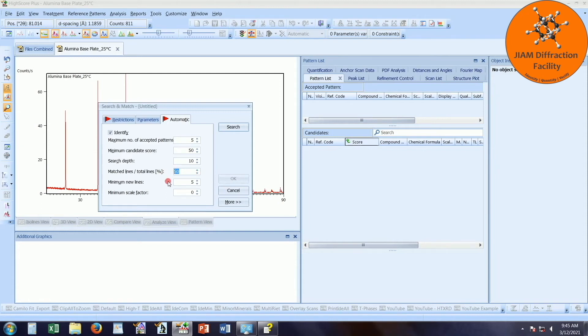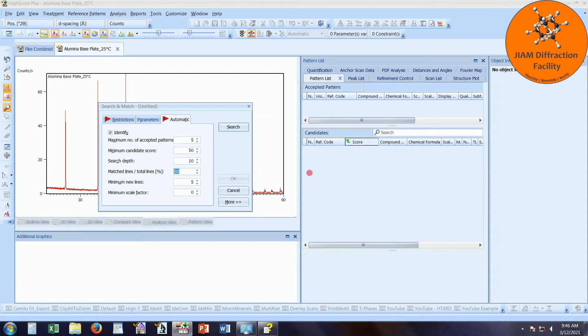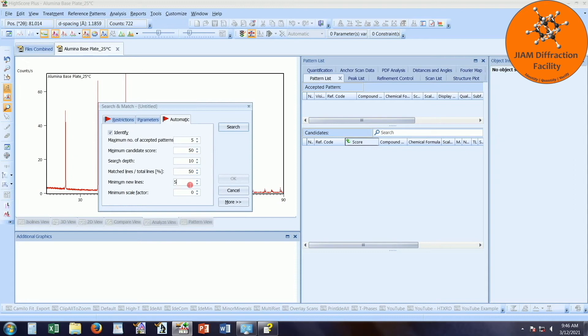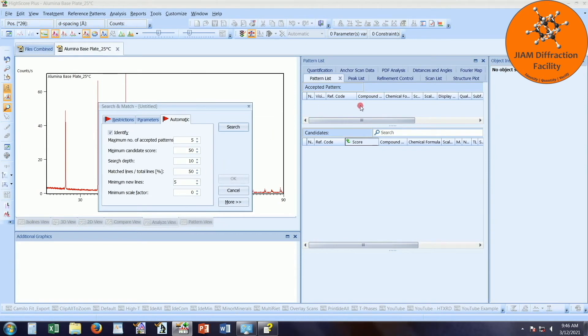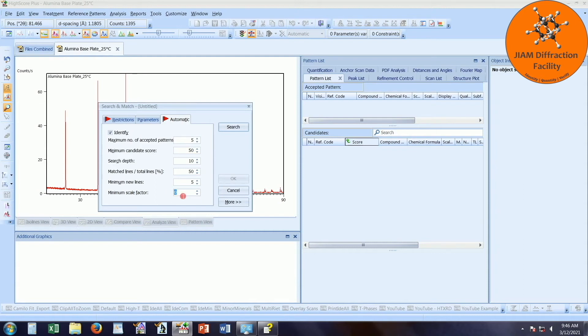Here we have matched lines divided by total lines, 50%. What I believe that means is that at least 50% of the lines in the candidate pattern must also be in the data pattern. Minimum new lines. This is the absolute minimum of new matching lines for each candidate. I believe it means that a candidate must match at least this number of lines that have not already been matched by other accepted patterns. Minimum scale factor, this just means that anything with a scale factor less than, I have zero, will not be accepted.